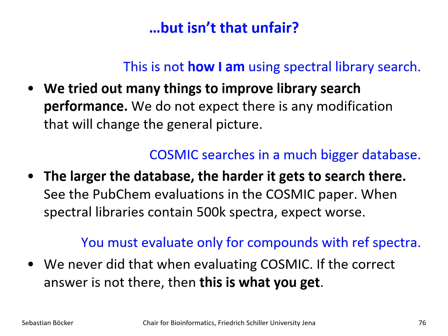I mean, if you search in a biological data set, you can't first remove all those where you don't have any hits. You don't know which of them are not in your spectral library. You search all of them and you hope you find hits, good hits. But it might happen for many of those queries that they're not in your spectral library. So this is what you get.